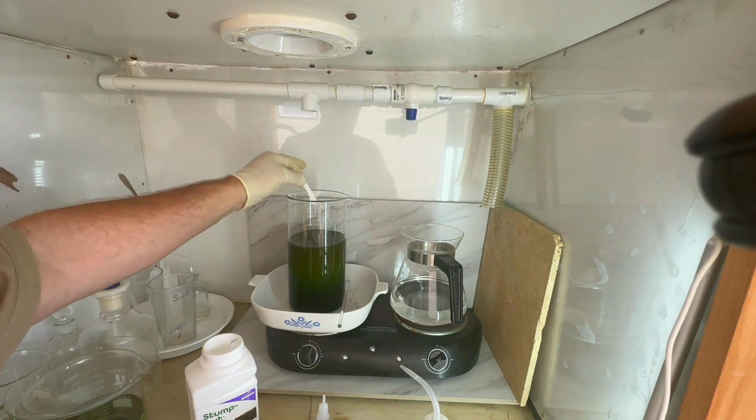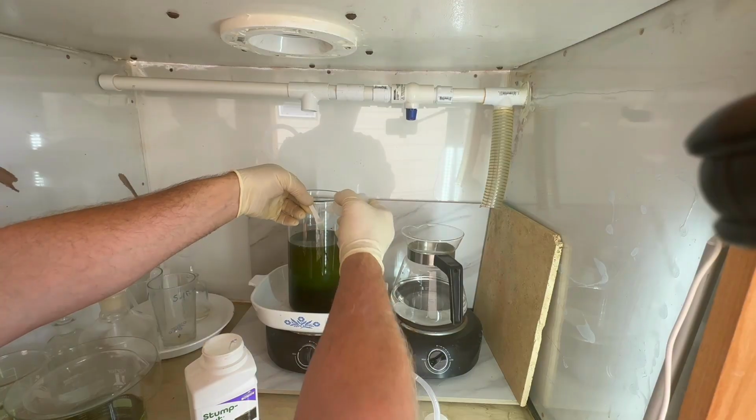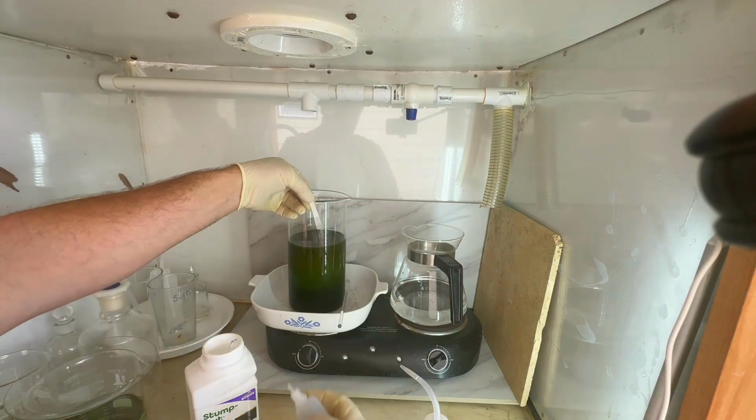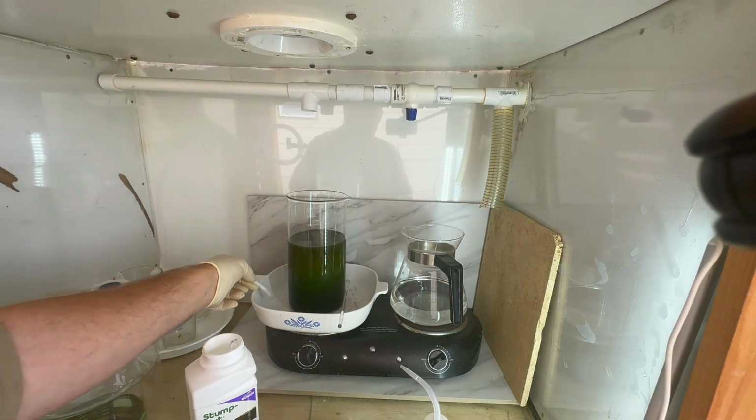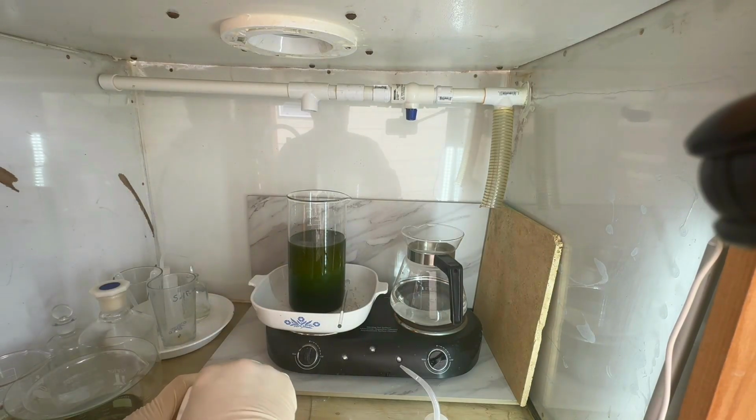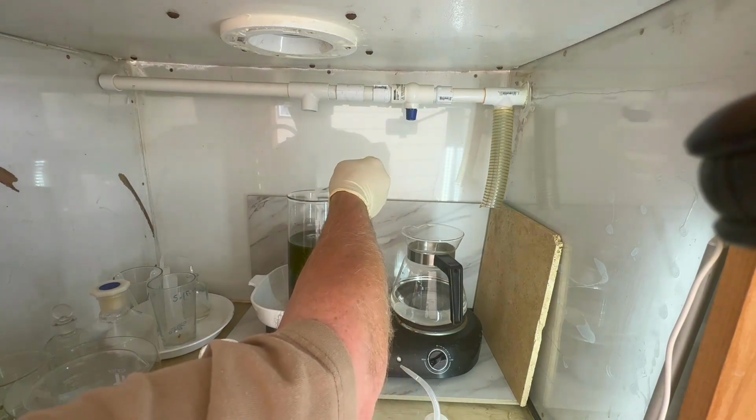All right, test with our stannous chloride. It's probably a little hard to see, but if I get the light just right, you can see it's slightly positive. So we're just going to give it another teaspoon here, stir that in, and test again.